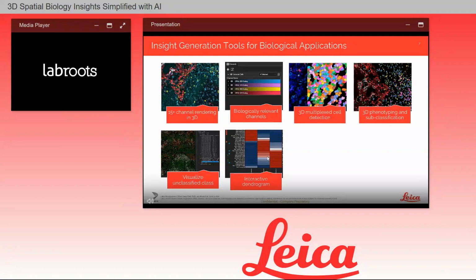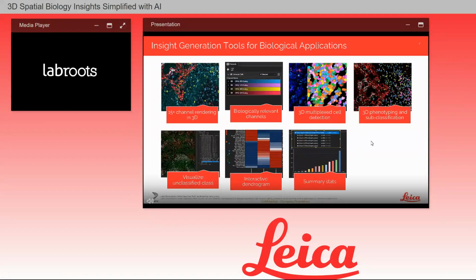In addition, we have a number of interactive data exploration tools via charting, including this marker cluster dendrogram, a violin plot, scatter plot, histogram, and dimensionality reduction plots. In addition, we have summary stats that are easy to read and interpret for counts and percentage distribution.